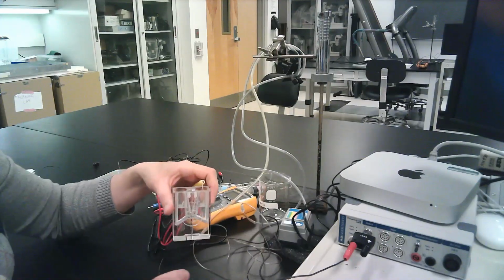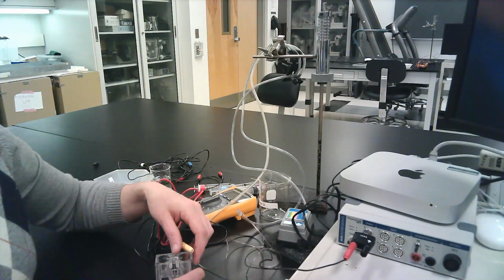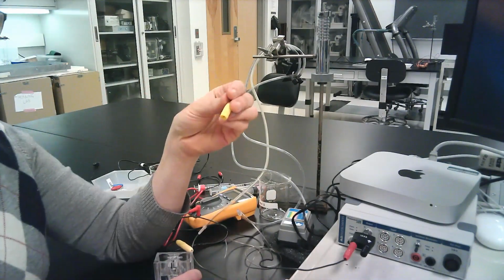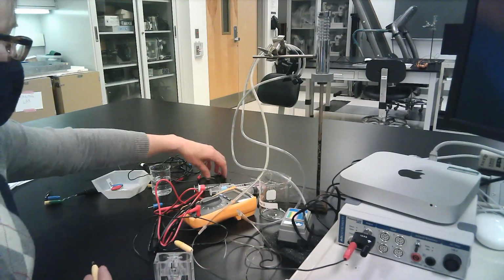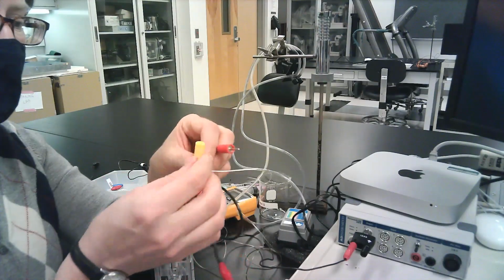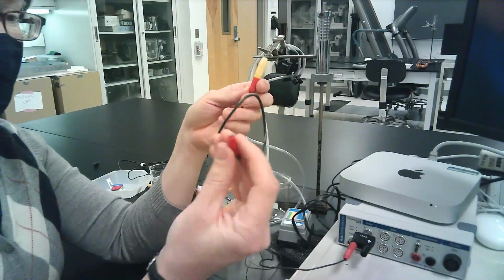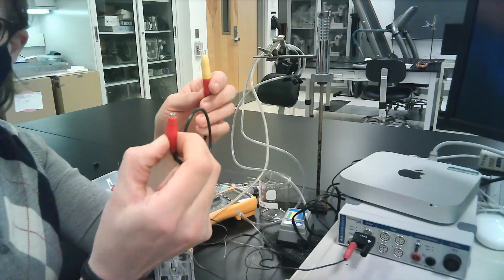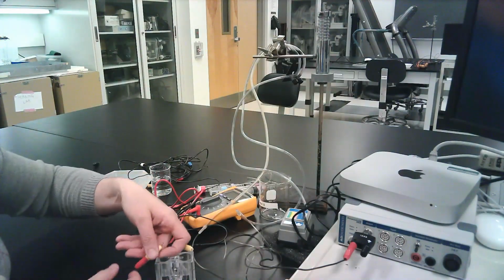After that, at the other end of the stimulating circuit, you'll find another yellow connector piece. And this is going to connect into a piece of wiring that has a red connector. And the other end of it is an alligator clip. So this alligator clip has little jaws that open up. And then we're going to put a multimeter in line with this circuit.